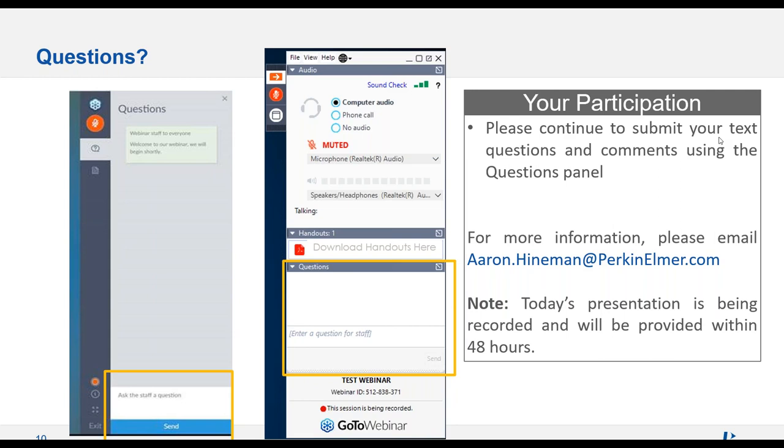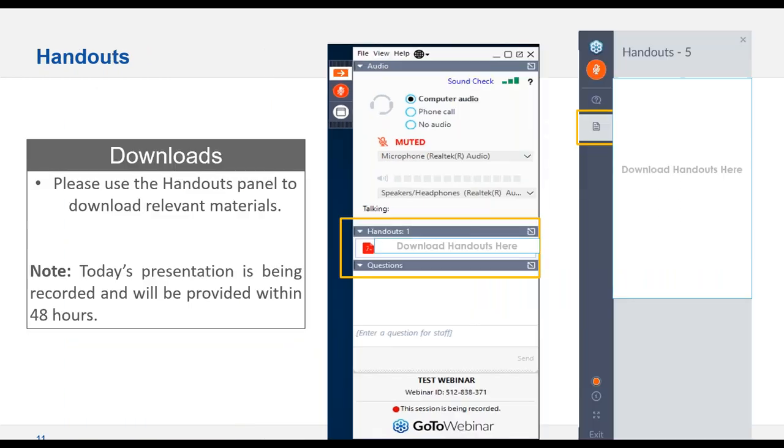Is a clean lab necessary? The answer is clean for lithium, yes. Clean room, no. Our lab, we actually maintain what's called a boron and lithium free lab. I call it my class 1 million clean room because we have filters in the AC vents and a double room chamber, but other than that, we just wipe it down and make sure that we're clean for those two elements. So a full-on clean room, no, but you do want to keep your room clean for lithium.